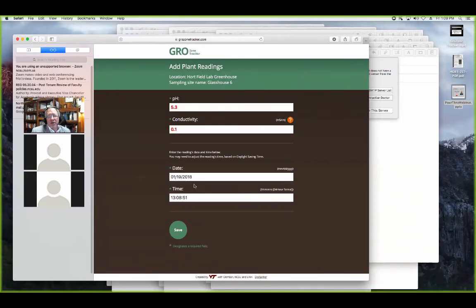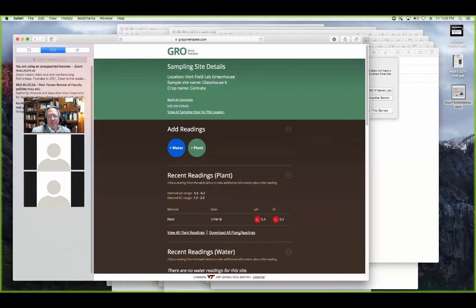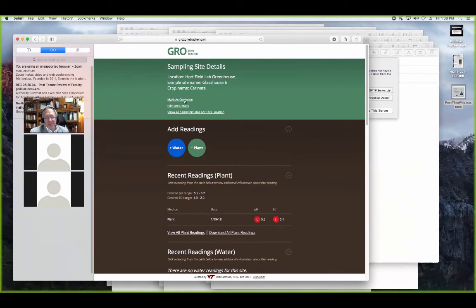You can put the date in, go back and change values later, and then save it. It goes into the database and gets plotted. Here's a reading you can look at showing it's too low for both pH and EC. When you're done with a crop, like poinsettias, you mark it as complete. Then when you bring in a new crop like geraniums for the same spot, you start over again on the same space.